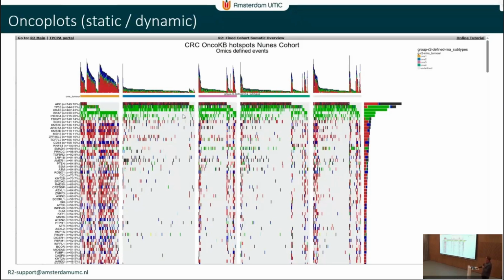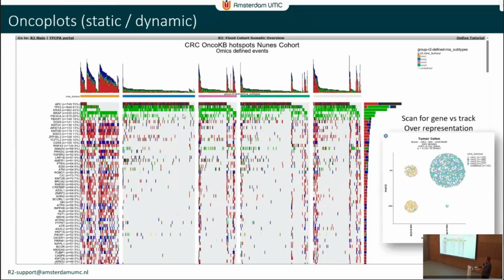On top of that, we also have a discovery module on this where it's going to use Fisher exact tests or chi-square tests to associate any of those genes that we identify over here against all of the clinical features that we have. So we can constantly brute force test every possible combination to identify whether there is a particular gene that shows an interesting association based on all of the criteria that we've used here to build the oncoplot.